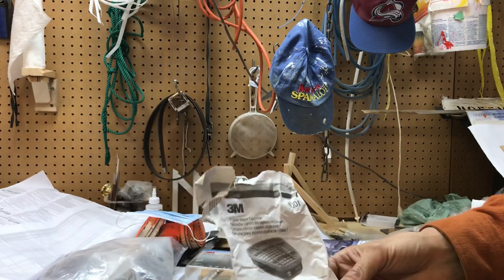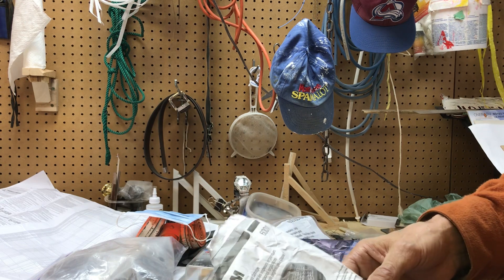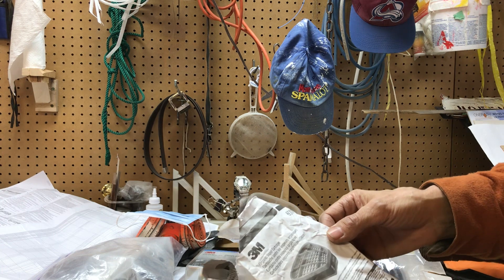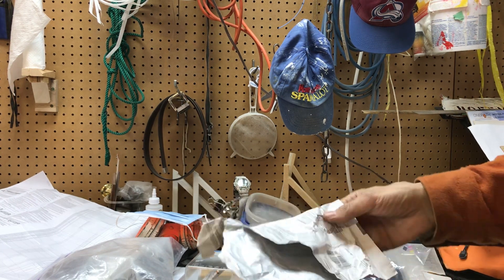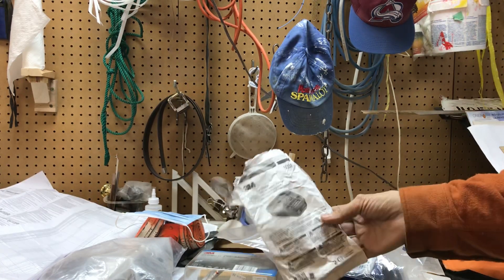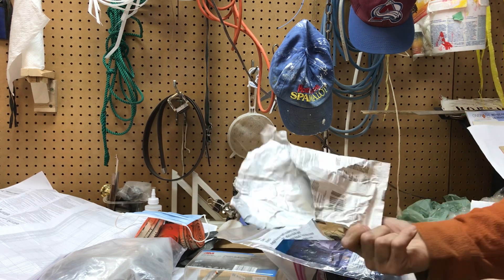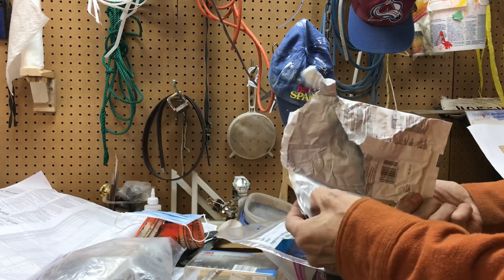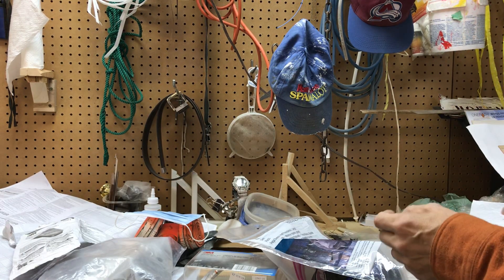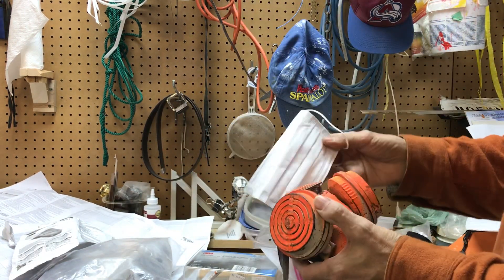This is a video on respirators, how I store mine, and what to be careful about to make them last a really long time. You can make even just the dust filters last a really long time. The envelope that the chemical cartridges come in is the most important thing in the package — it's airtight, sealed right from the factory. I'm going to show you how to keep your cartridge for a long time.